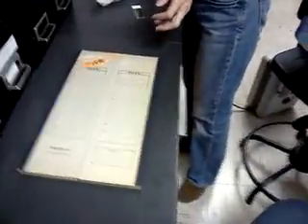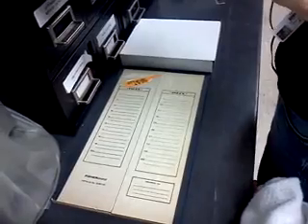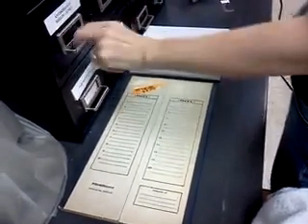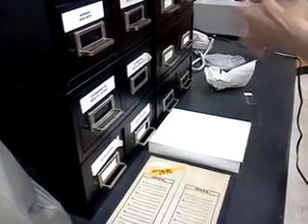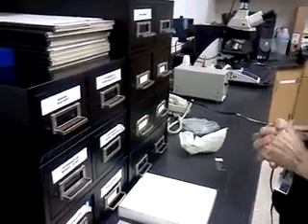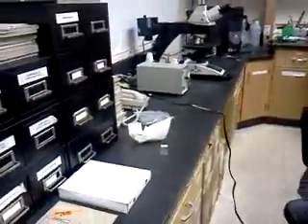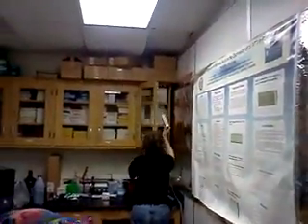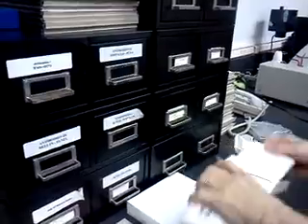Now what you do is you grab yourself one of these, and we have quite a few, but you probably want to order those because you're going to have lots of these. So this is a storage thing. I told you about archiving. You see these things are filled with all the slides that we've been doing. So the archiving system that we came up with is this. You can buy these little things from either Fisher or VWR. And then what we do is we buy these things, which are microscope slide holders.